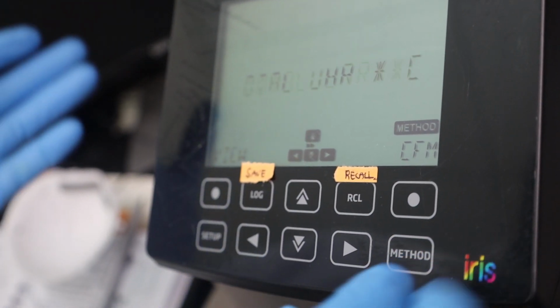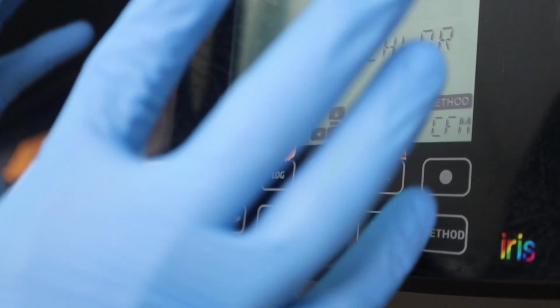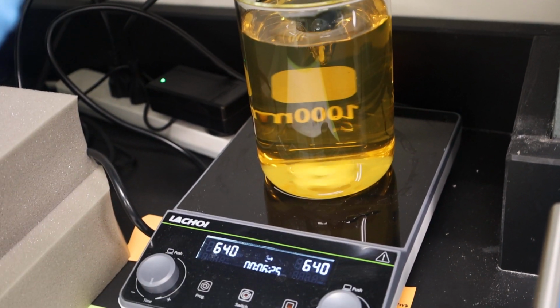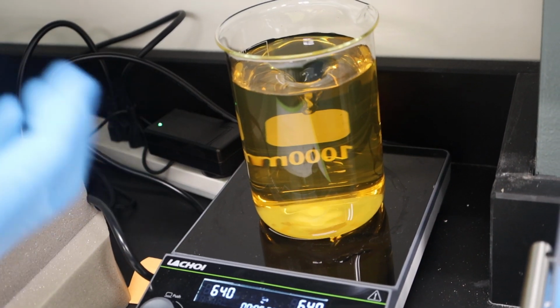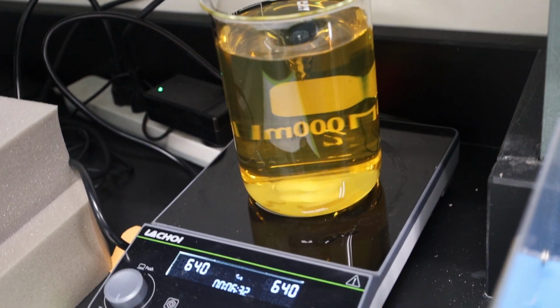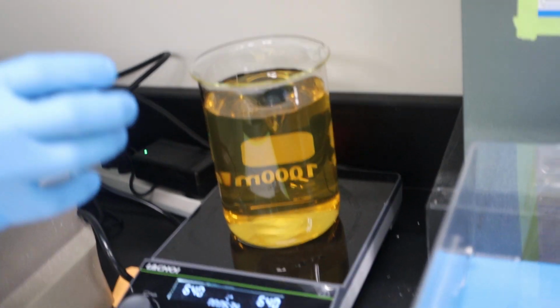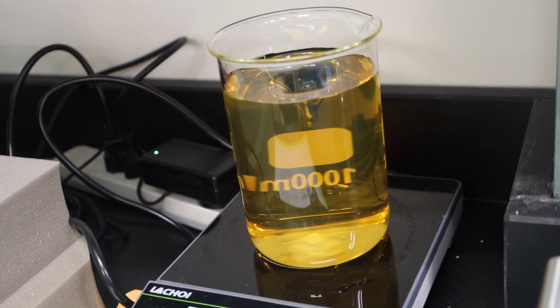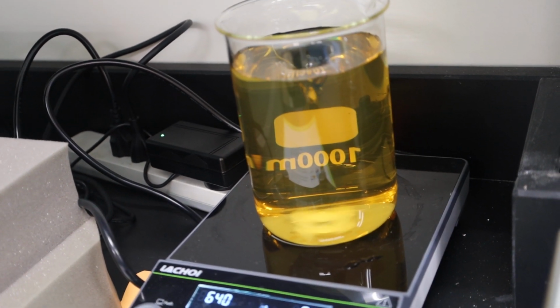But if you want to transport data, maybe after putting in your samples, we're going to go through a quick process of how we have to test this concentration for typically COD and also total phosphorus and nitrate and total nitrogen contaminants. This is more like a synthetic wastewater that is simulated in the form of domestic wastewater with some amount of COD concentration we're going to test right afterwards.